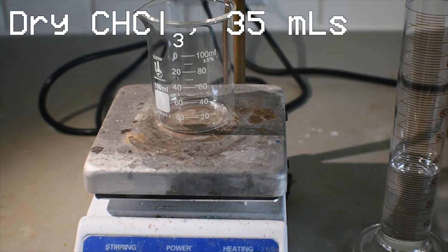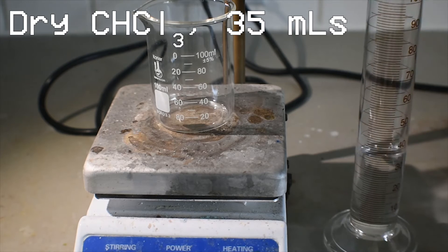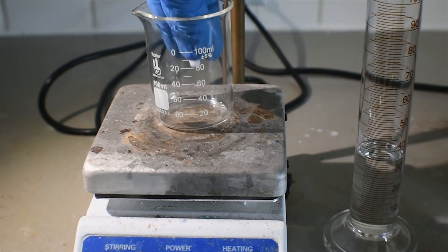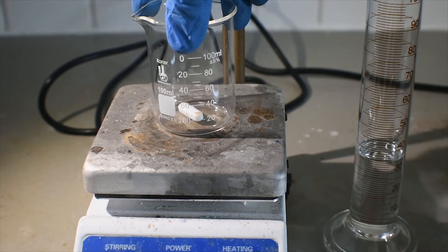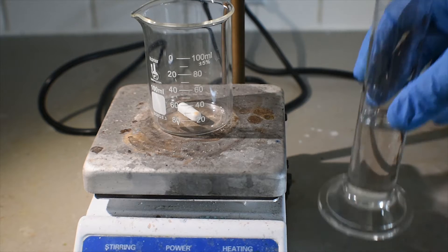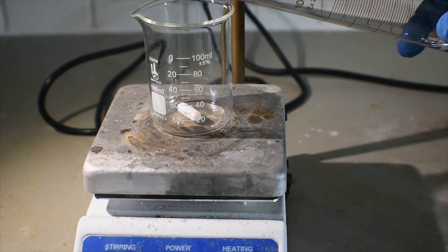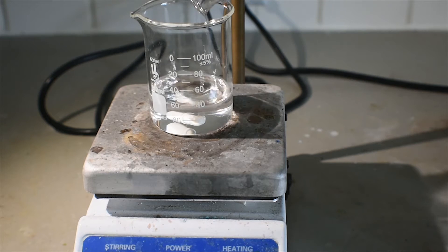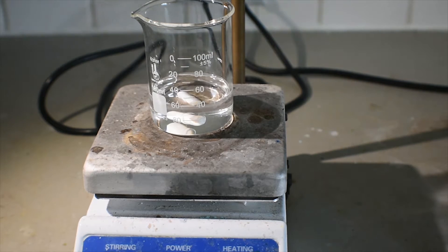Here I have 35 milliliters of dry chloroform and a 100 milliliter beaker on the hot plate stirrer. I'm just going to put in a small stir bar to stir the reactants and I'm going to add the chloroform.